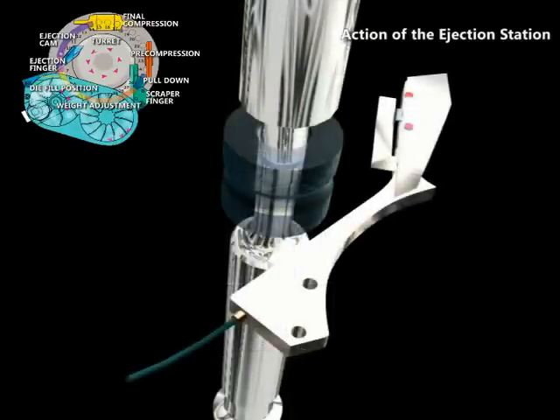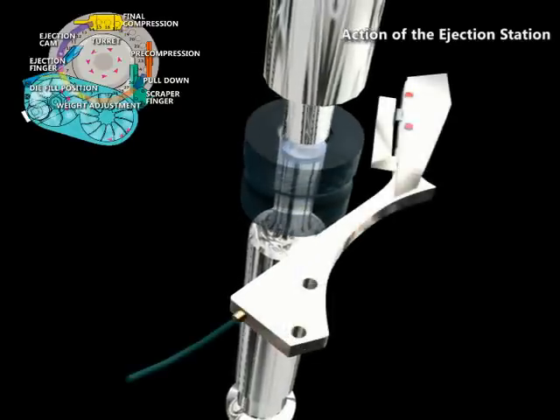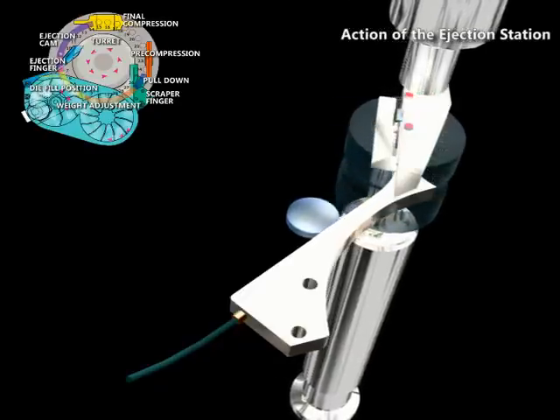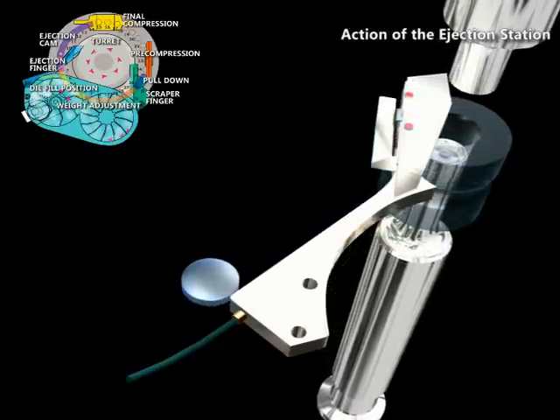Before reaching the full ejection position, the upper punch is lifted out of the die bore while the lower punch is being pushed up by the ejection cam, thereby pushing the tablet out of the die.